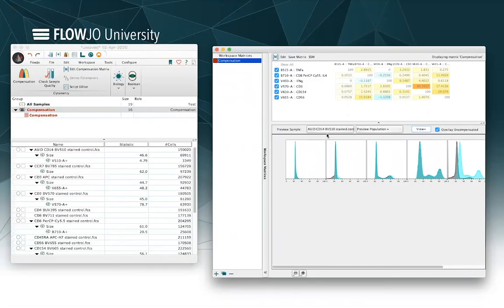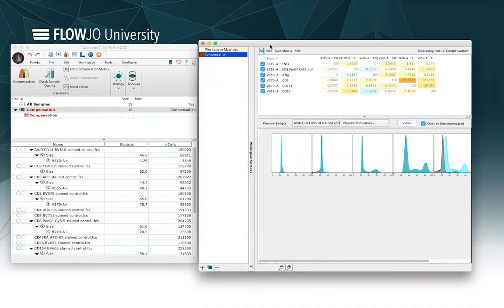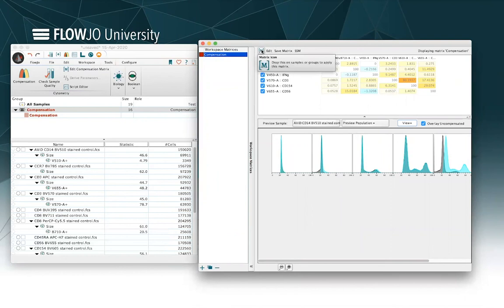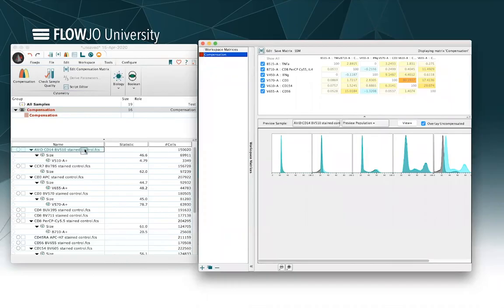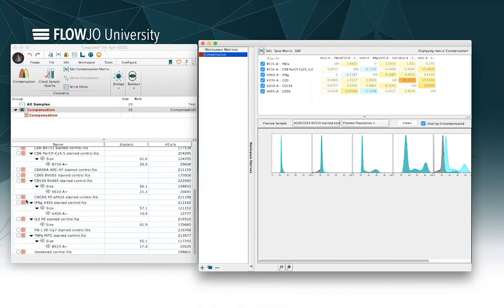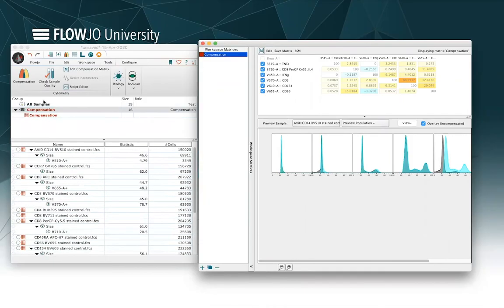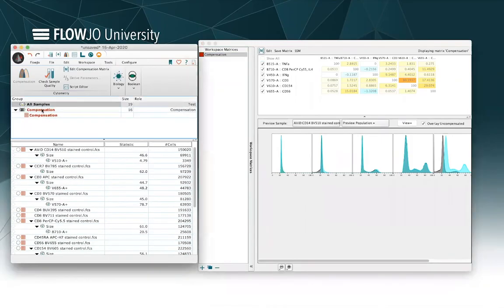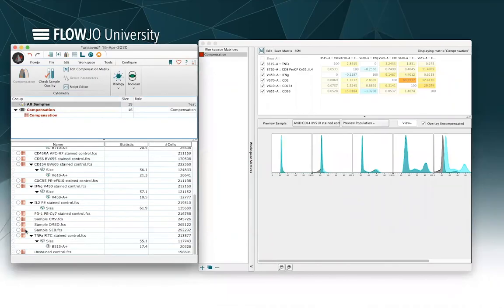You can also change your preview sample. Here I'm looking at actually one of the single stain controls, but we could look at this in an experimental sample. Once you're satisfied with the compensation matrix that you've generated, you can actually apply that compensation matrix by dragging this little M icon into your samples, and that can apply to a single sample or I could drag it up to the group and apply it to all samples. And we'll see that the compensation badge color here that's red appears to the left of the samples just indicating that those samples, in fact all of the samples including our experimental samples, have been compensated using this red matrix.